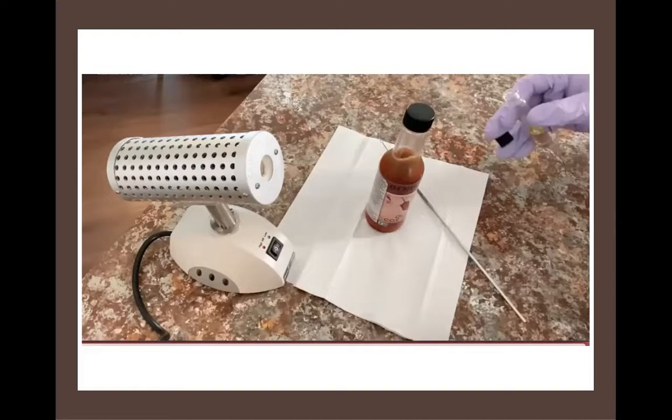I'm also briefly warming up the air that's in the mouth of that tube. And by doing that, I actually create a little swirling current of hot air. And just for a moment or two, that's going to protect the tube. It's going to prevent anything from falling down out of the air and going into the tube. So I've created a few moments of protection from accidental contamination.